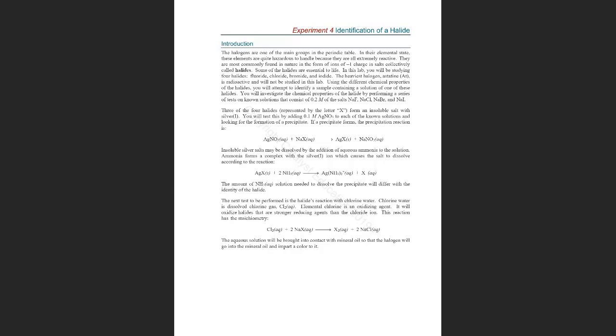Welcome to the Labflow workshop. We are going to study the second experiment in Labflow, which is identification of a halide.